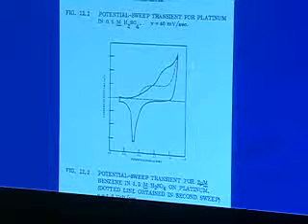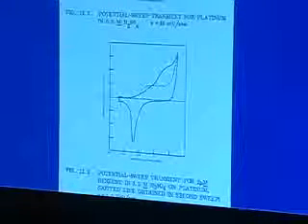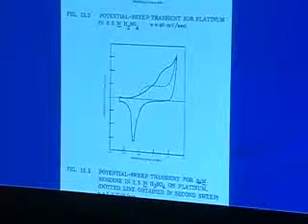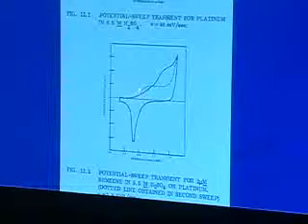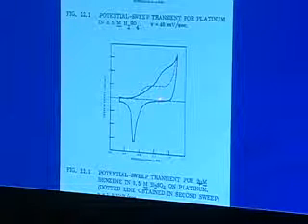It turns out you cannot oxidize benzene in solution at a platinum electrode, but you can oxidize benzene on the electrode surface. And once the surface is coated with whatever is left over after you've oxidized the benzene, that new surface can oxidize solution benzene. So the dash curve now, you've got this non-platinum surface, and it does oxidize benzene to some extent. But you get this chemisorption, you see it totally changes this pattern.